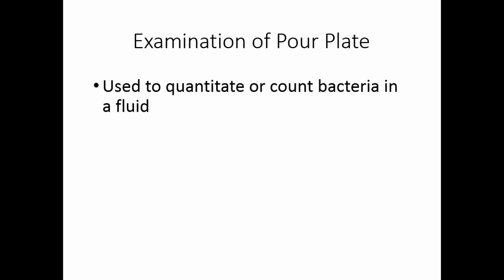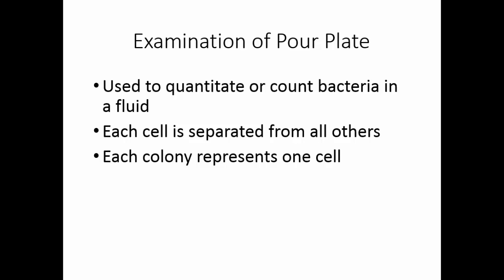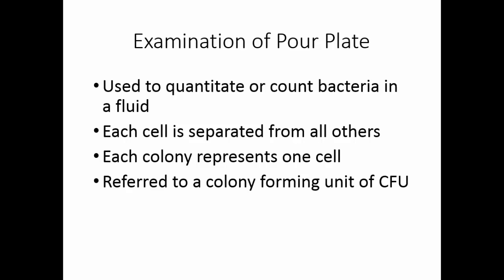The pour plate is used to quantitate or count bacteria in a fluid. The way this plate was made, all cells were separated from the others in that liquefied agar. Each colony that grows will then represent one cell. So we refer to those as colony-forming units.